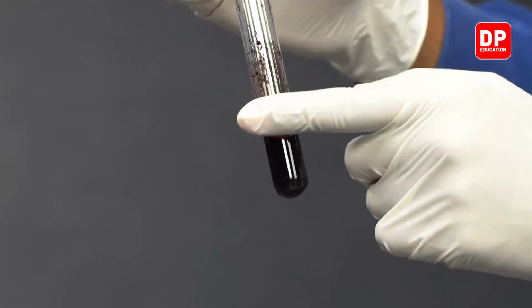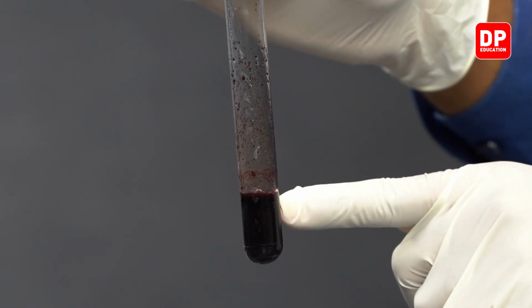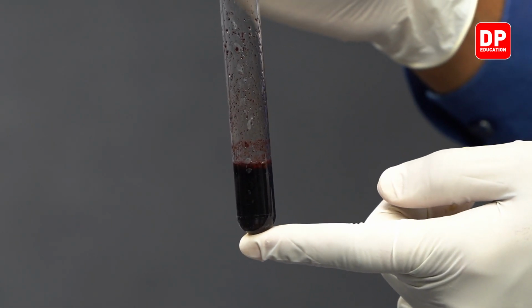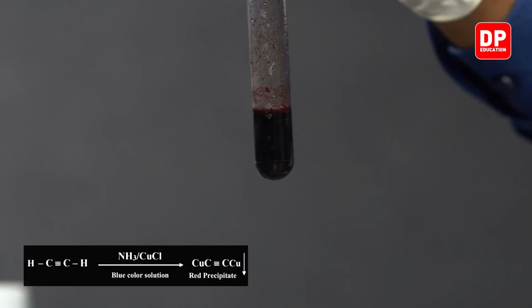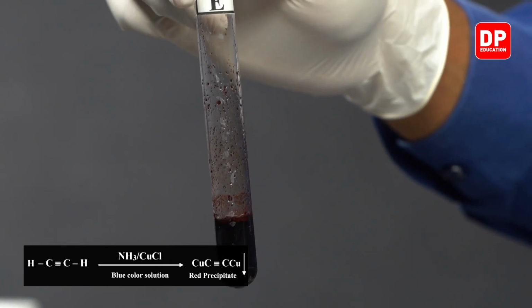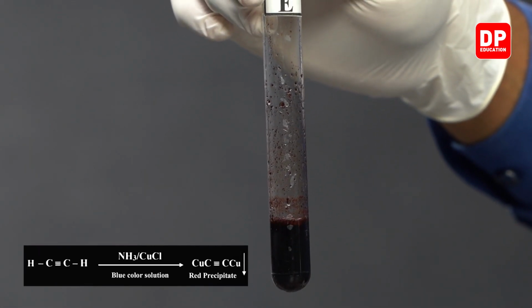You can see it is getting coated on the walls of this test tube here, right? When I shake it, you can see there's a reddish precipitate that is getting coated on the test tube. Since the reddish precipitate is suspended over here quite densely, you might not be able to observe the color here, but over here you can very clearly see that we have formed a reddish precipitate, which is copper 1 acetylide.